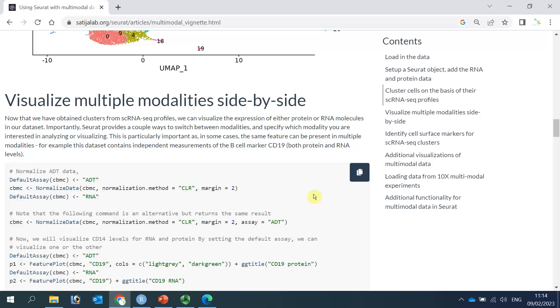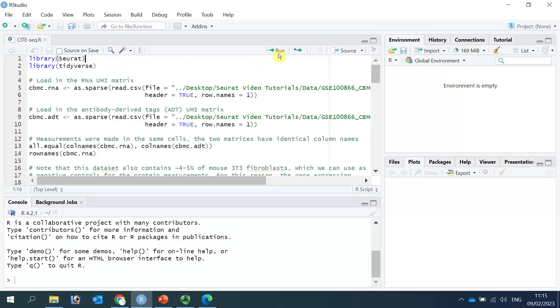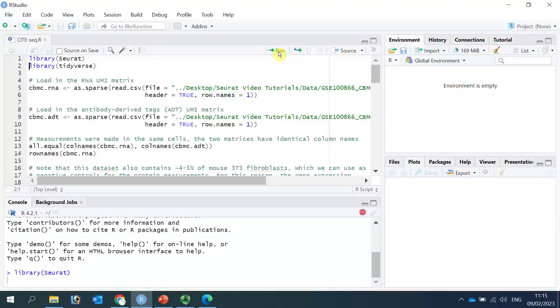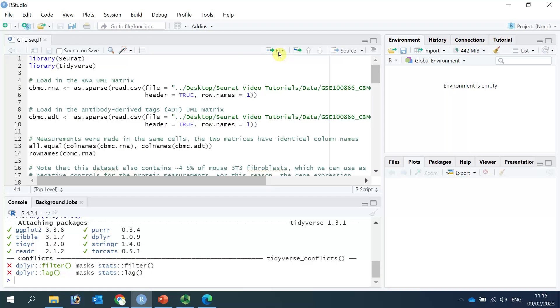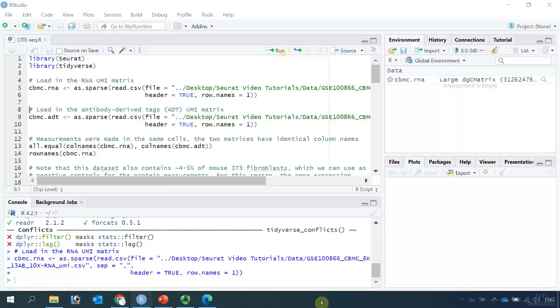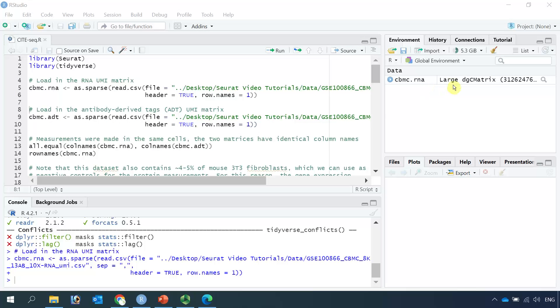I've downloaded the data already, so we can open R. First, we need to load the libraries: Seurat and Tidyverse. Now we can read the RNA-seq data in. You can see in this window we have the RNA-seq data. At the moment it is a large dgCMatrix data.